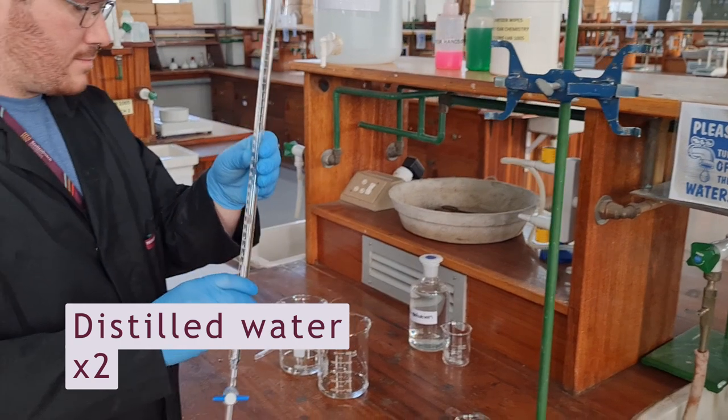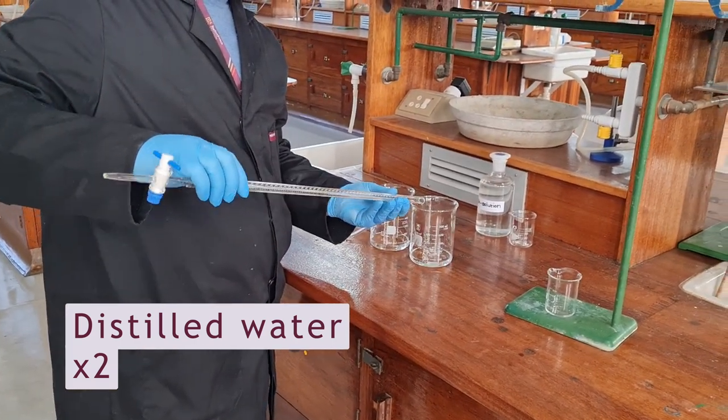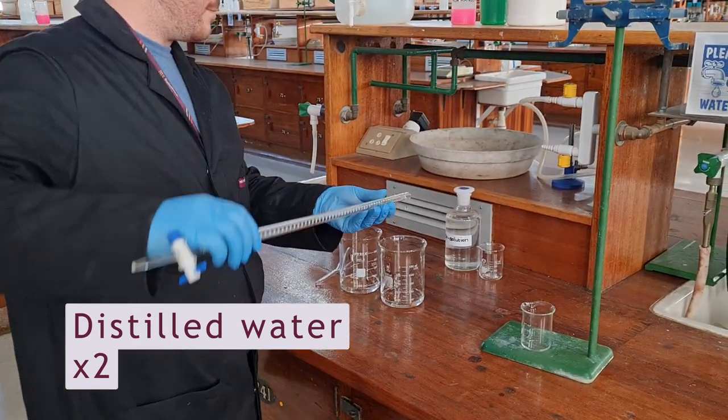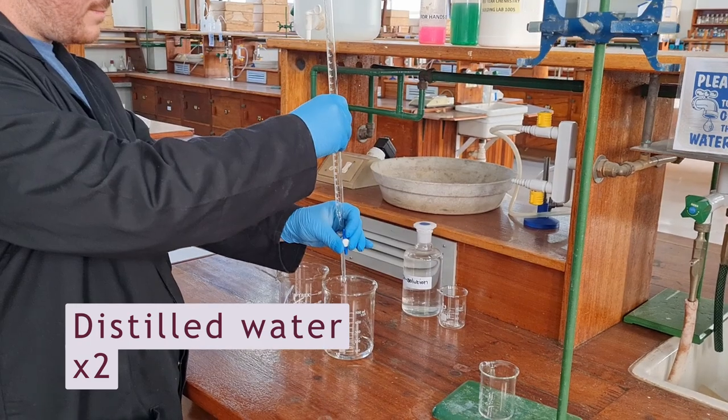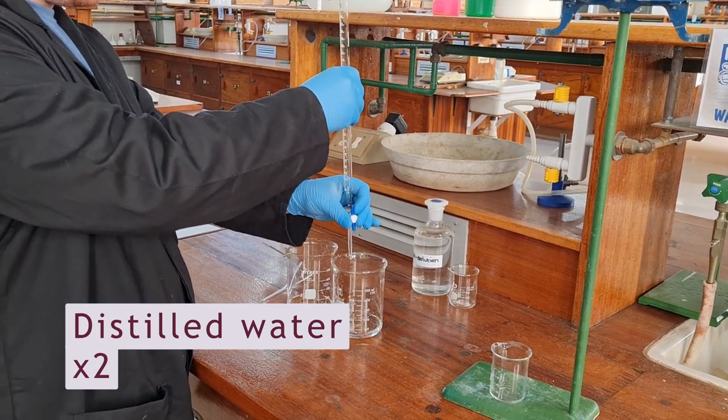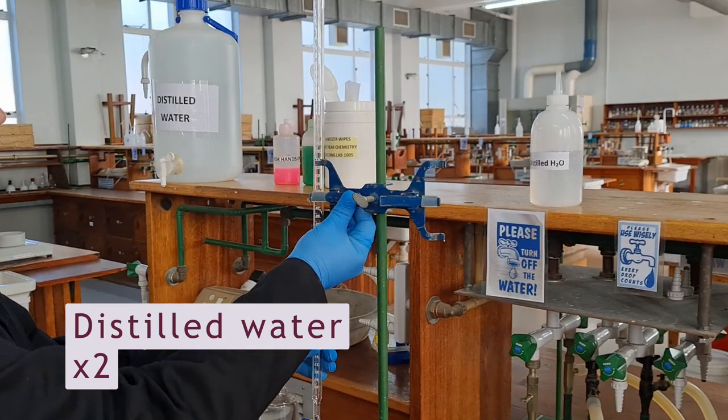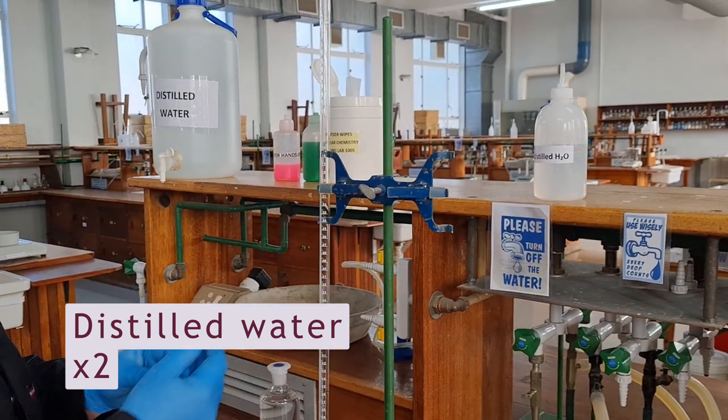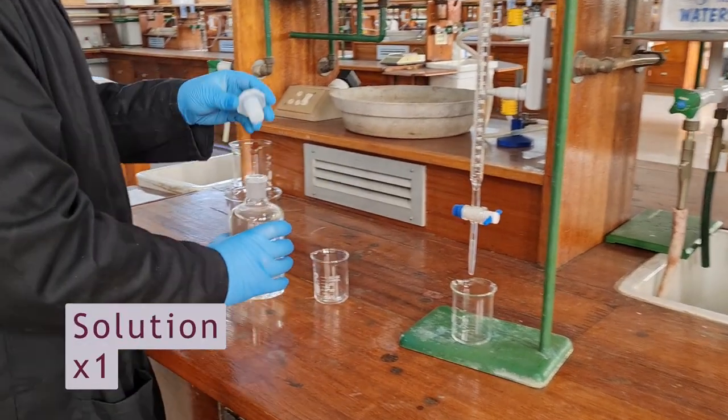Then remove the funnel and carefully tip the burette on its side while turning it in your fingers so that the solution comes in contact with almost the entire length of the burette. Invert it while continuing to turn it until the solution runs out into a waste container. Repeat this step once more for distilled water and then again with the solution.